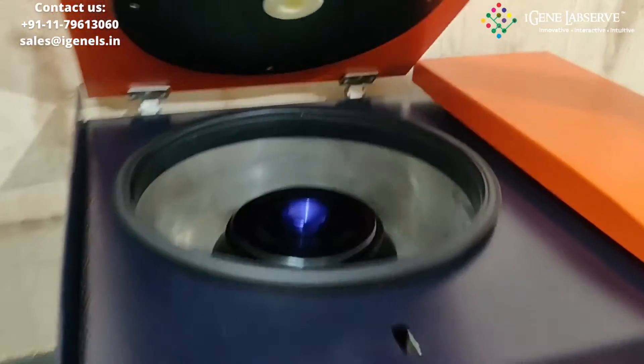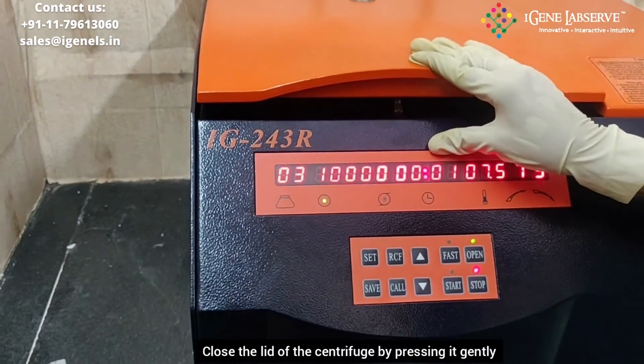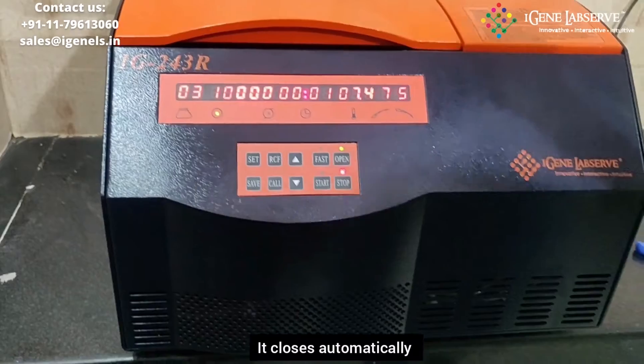Once the lid has been put in, you have to close it. To close the lid, you have to gently push it and it closes automatically.